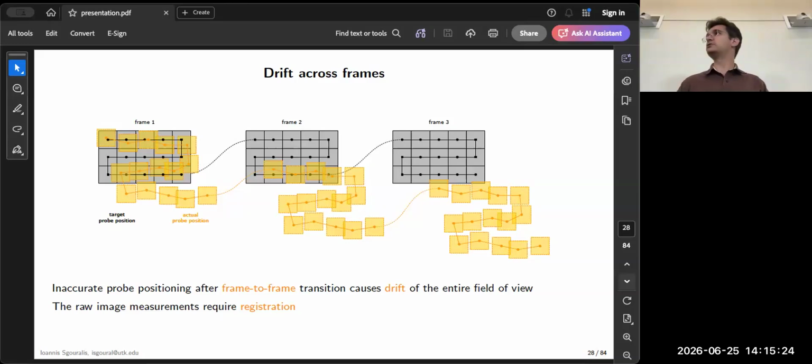That's exactly what I want to illustrate and focus on today: how we can utilize image registration techniques, adapt them in the right way, and come up with a mathematical method, a computational method, an algorithmic framework that we can use to correct the operation of the microscope while it is actually working.